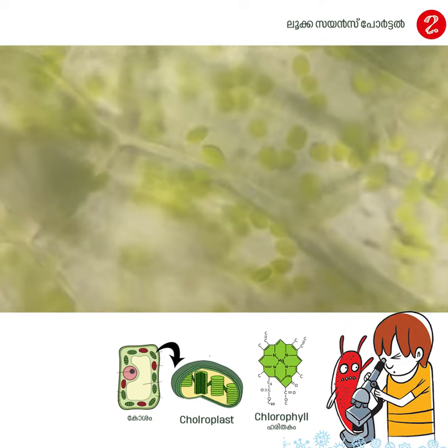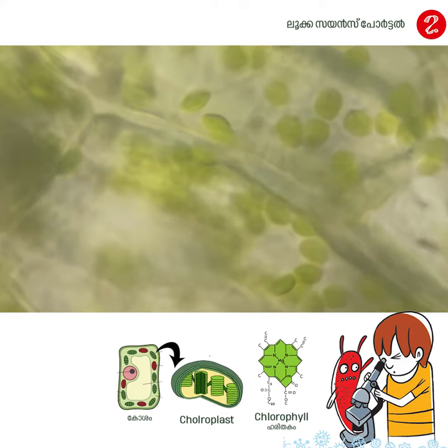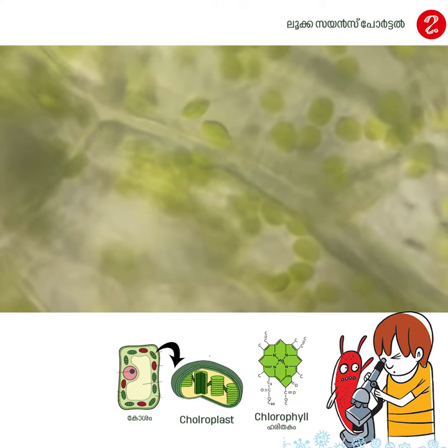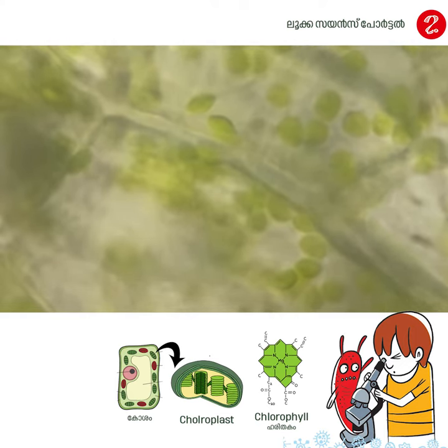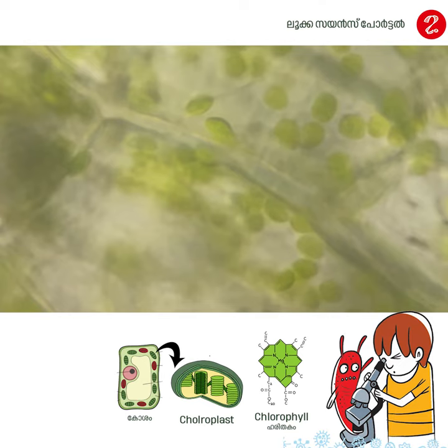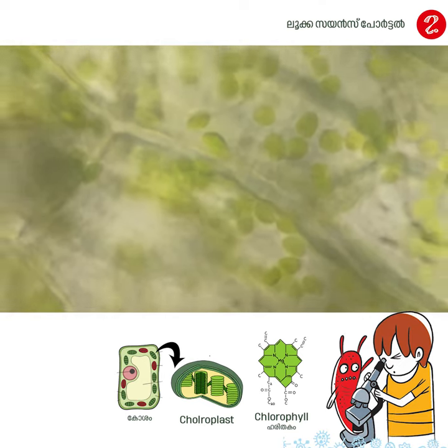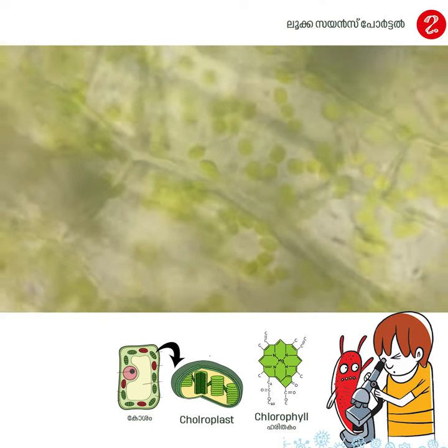Chloroplast is visible near the cell wall. This is cytoplasmic streaming. This is visible in the light. This is cytoplasmic streaming.